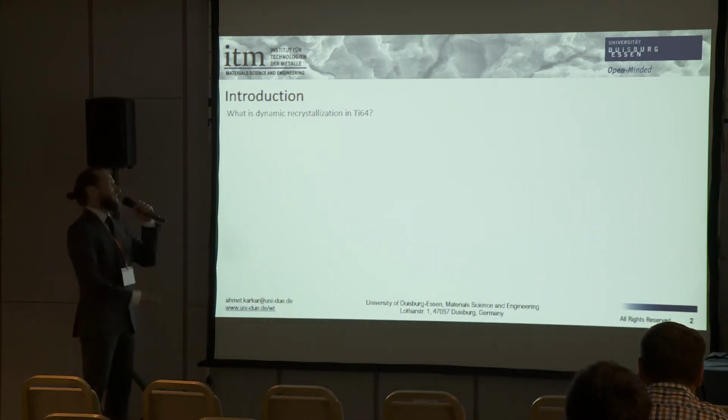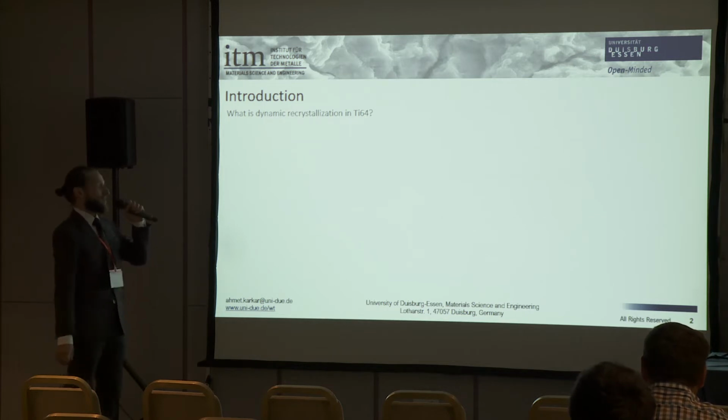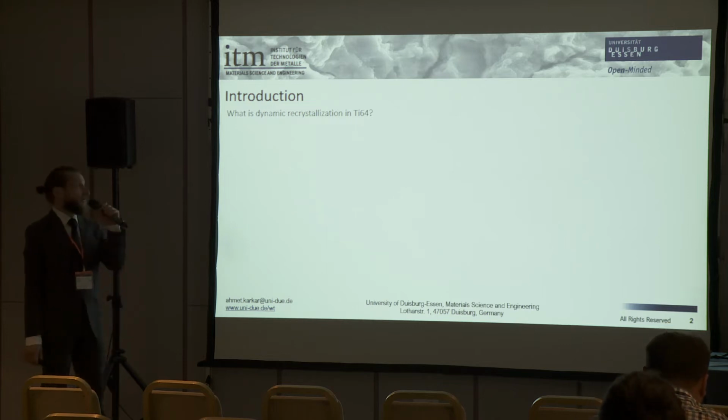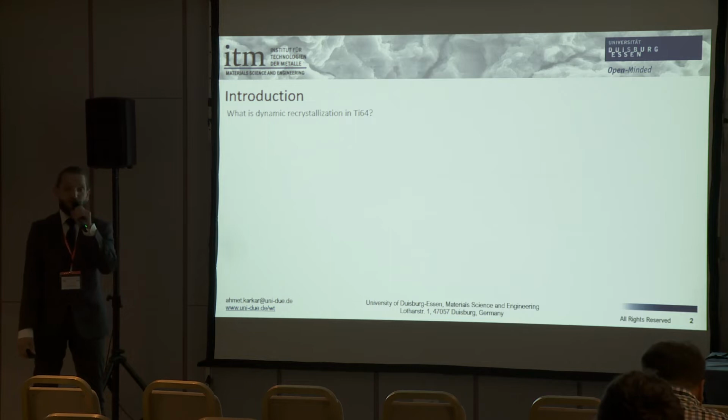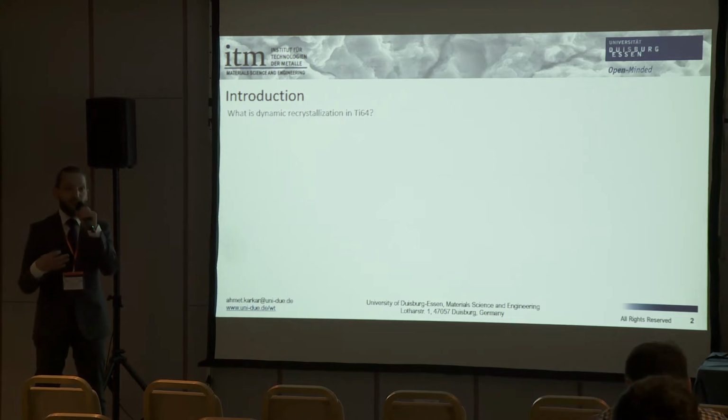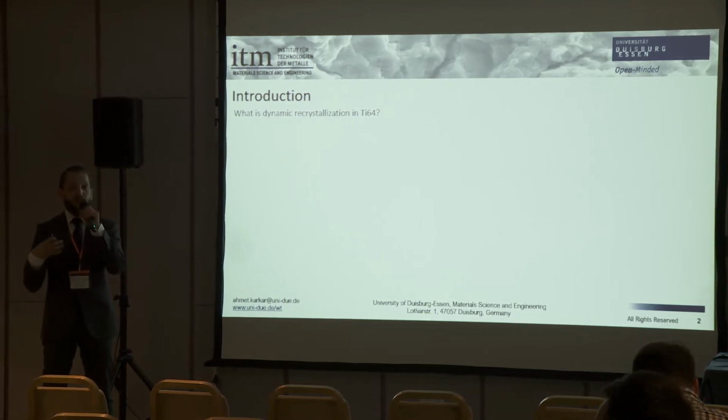Okay, thank you very much, and good afternoon, and thank you for letting me present the microstructure of dynamic recrystallization in titanium after some complex multi-axial stress fatigue test. In this presentation, we focus on systematic investigation of dynamic recrystallization and its effects on texture, orientation, and grain refinement in titanium 6-4.